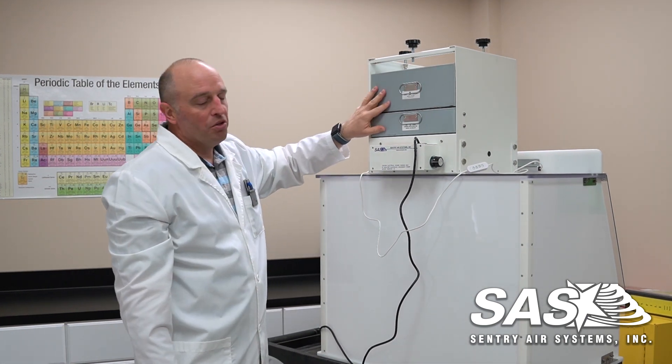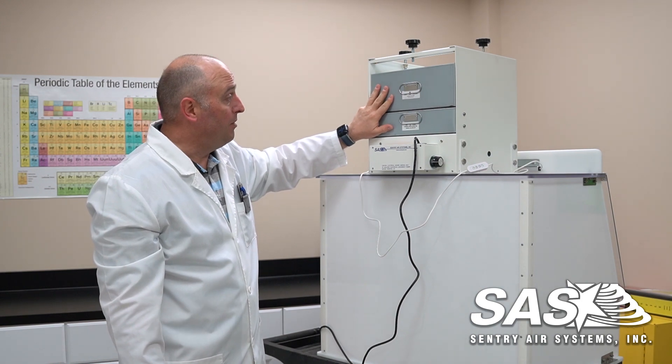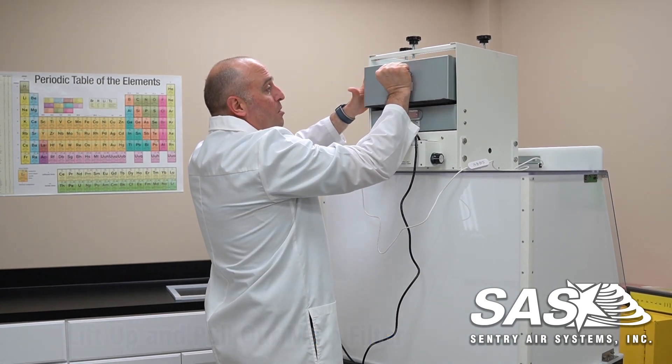Now here your gaskets might be a little snug and stuck together, which is a good thing because you want the seal to be airtight. You might have to push up a little bit to get it to unseat. Once it's unseated, you can just pull it straight out.